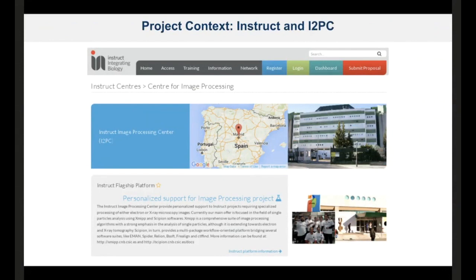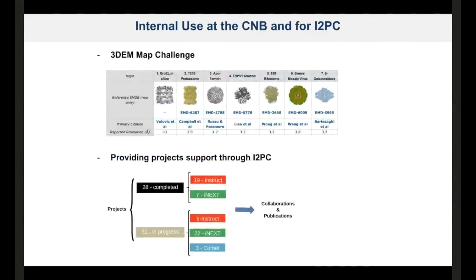That's why my former group in Madrid was committed to Instruct, a European infrastructure where you can apply for microscope time, sample preparation, and image processing. In that sense, we were committed not only to provide algorithms as in XMIPP, but also to provide this infrastructure.